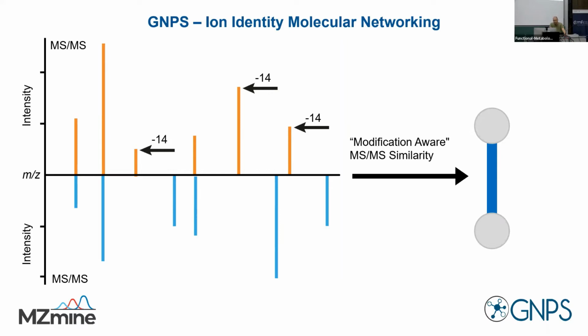Because I feel like, well, you could say, well, they all have carbon, so they are closely related, right? Yeah. But also, do I have any influence as a user on that? Yeah, that's a very good question.